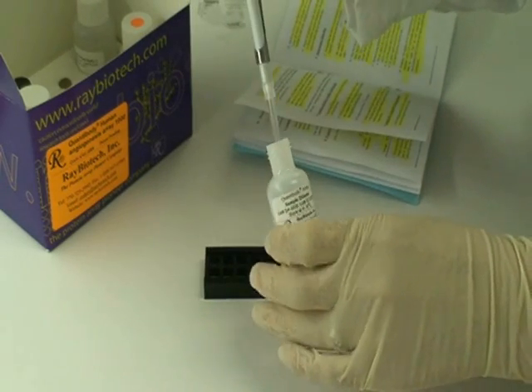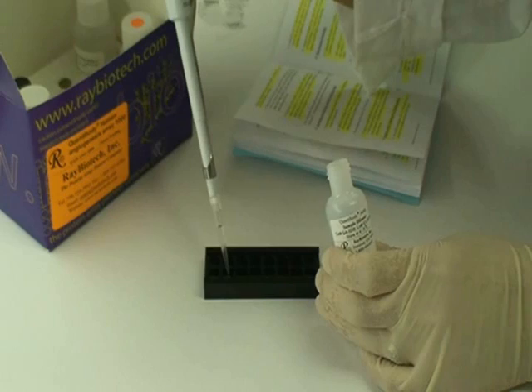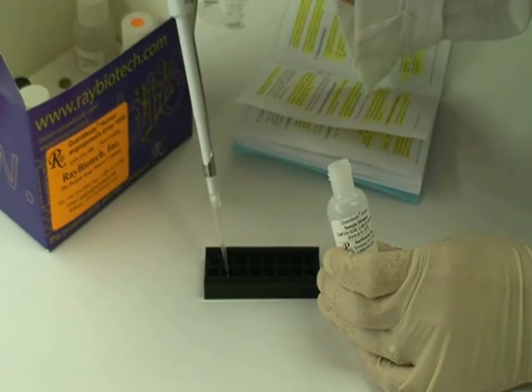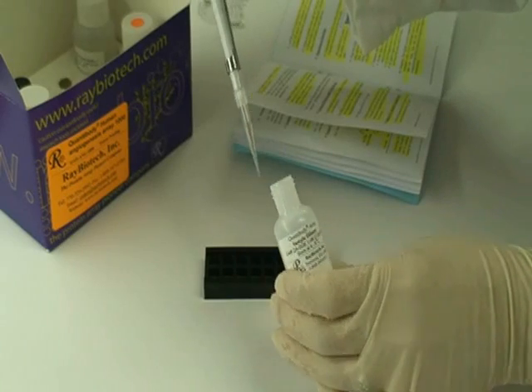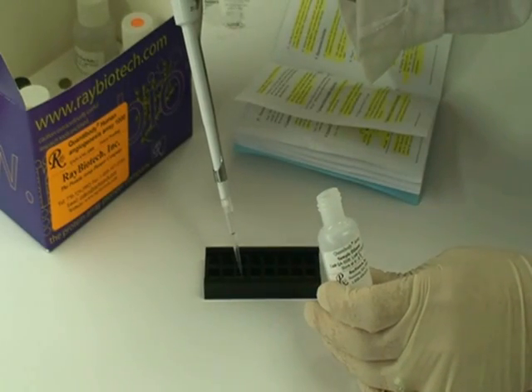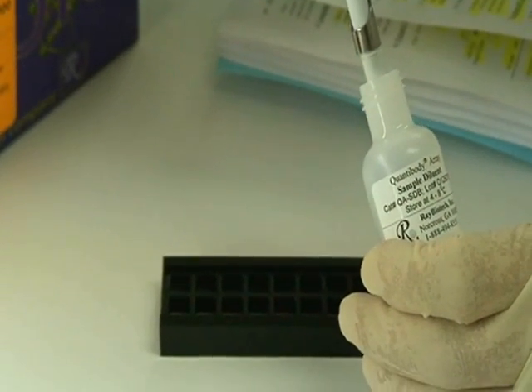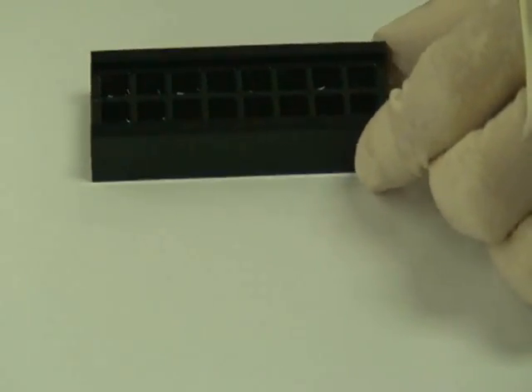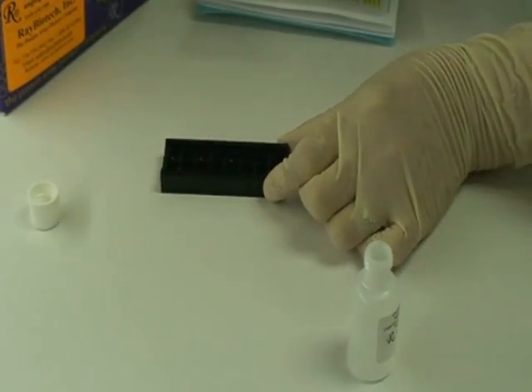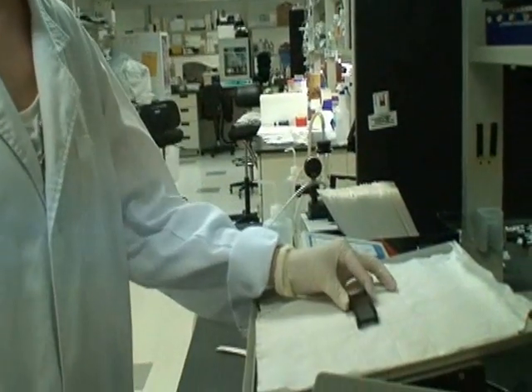Add 100 microliters of sample diluent into each well to block the slides. When adding reagents to the slide, touch the pipette tip to the outermost corner of the well and release the liquid gently. This will prevent the antibody spots from becoming smeared. It's also important to avoid bubbles within the wells. Block the slides for 30 minutes on an orbital shaker at 1 to 2 cycles per second. You may also block overnight at 4 degrees C.